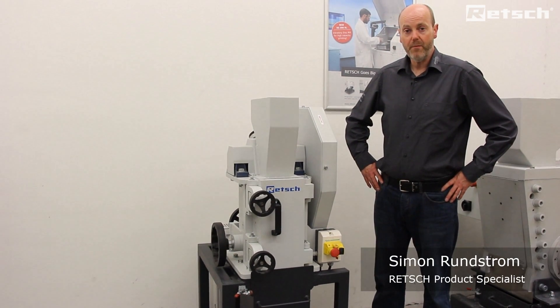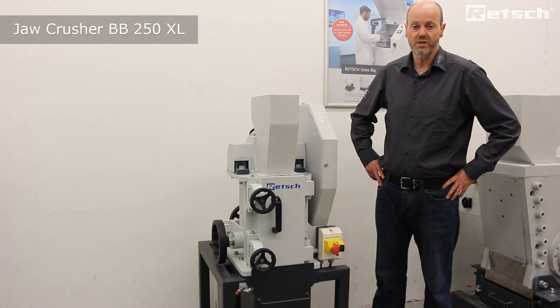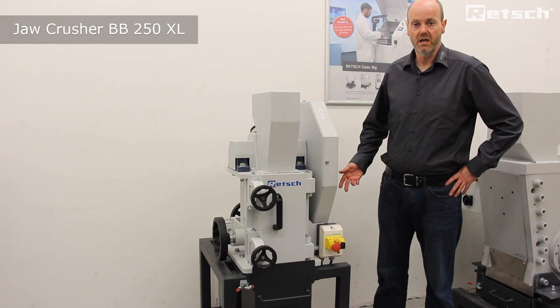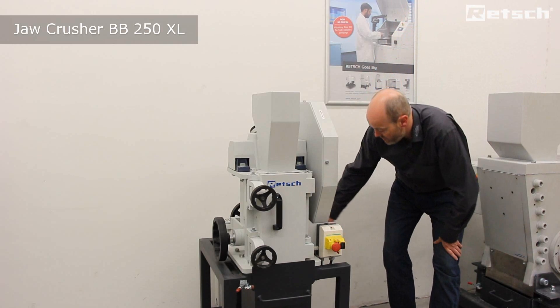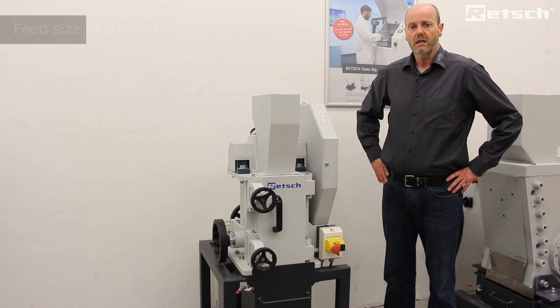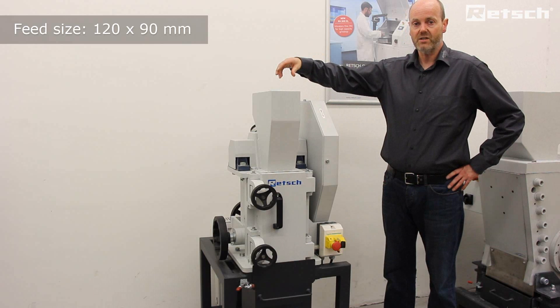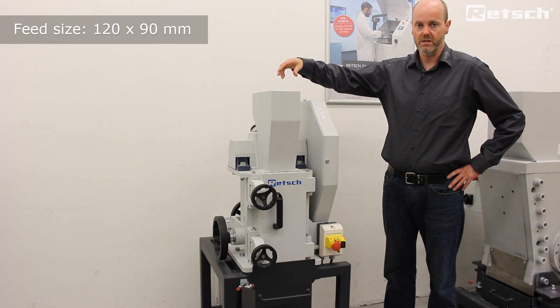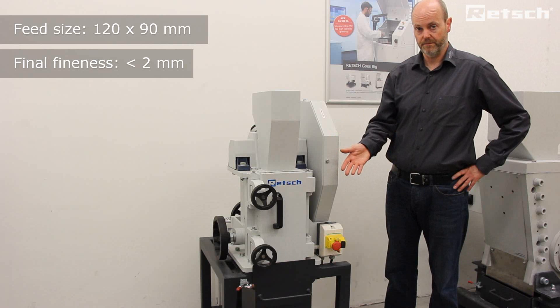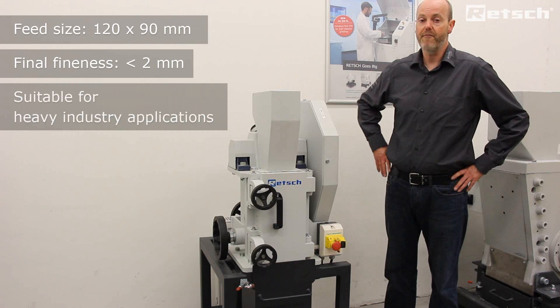Hello, please let me introduce the BB250 XL jaw crusher, which lies within the family of jaw crushers. It is a floor standing instrument, as we can see, mounted on a very sturdy mounting frame. The BB250 XL can accept pieces of material in the top feed hopper with a maximum of 120 x 90 mm and reduce them in size to less than 2 mm, often in a single pass. This is a very wide reduction ratio, commonly used in heavy industry applications.